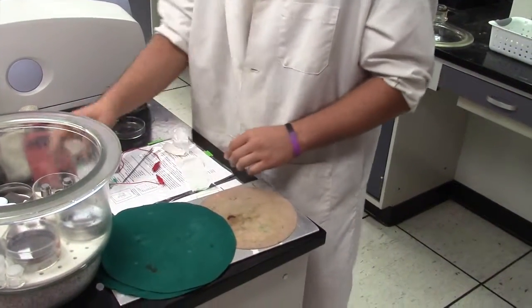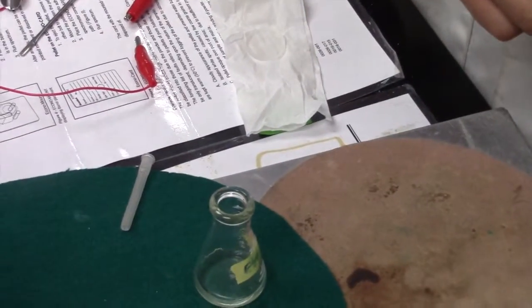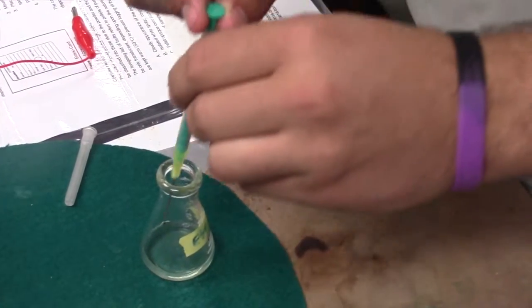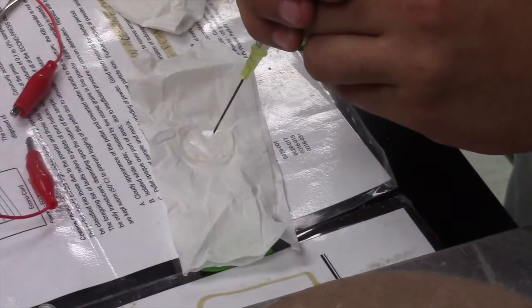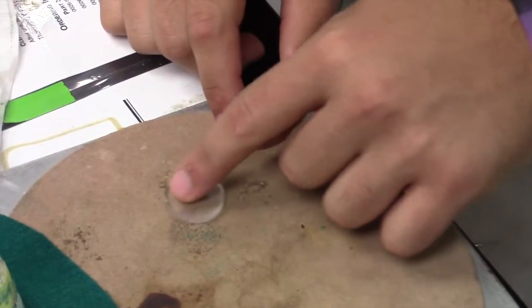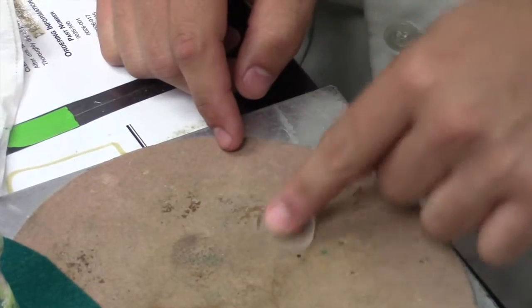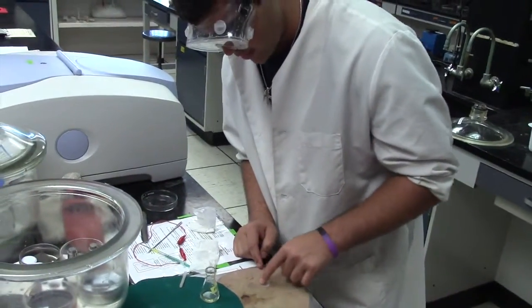So to clean the salt plate, you get a little bit of ethanol. You get your syringe that you cleaned before. You put it on there. And then you go in figure 8 motions. Only figure 8, nothing else. Can't go in a square, not a circle, not a triangle, not a rectangle.